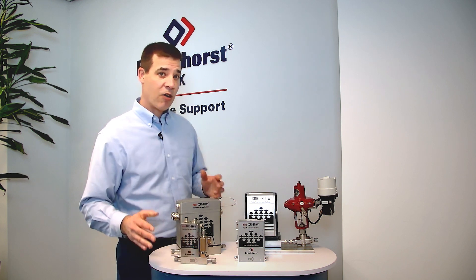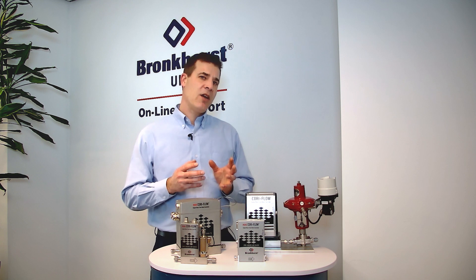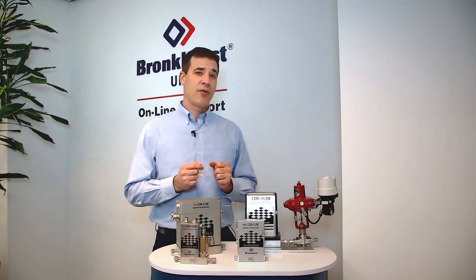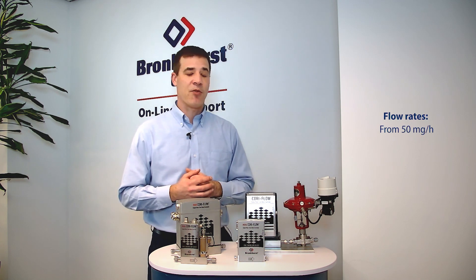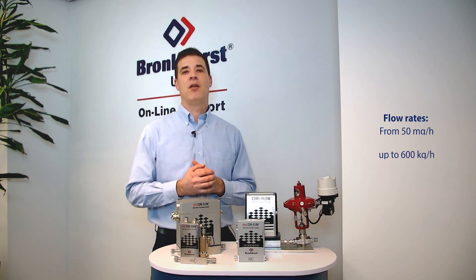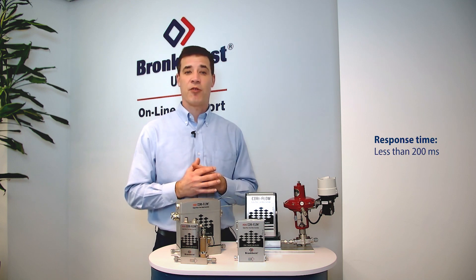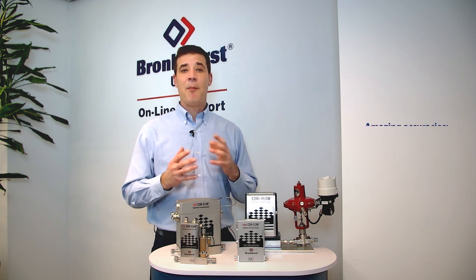Okay, so let's have a look at our Coriolis family. The Coriolis instruments can measure a range from 50 milligrams per hour up to 600 kilograms per hour, with an exceptionally fast response time of less than 200 milliseconds and amazing accuracies.